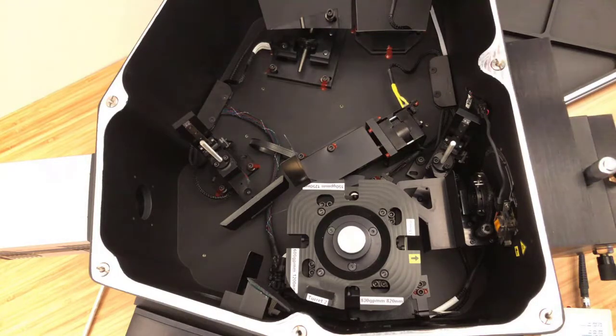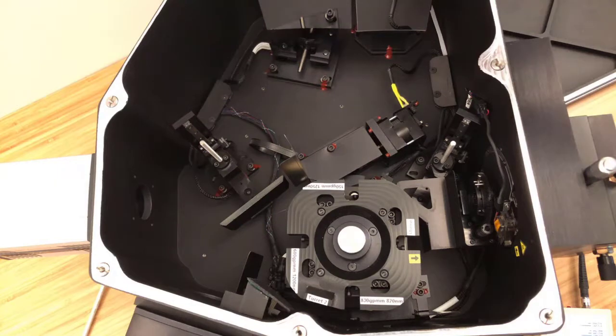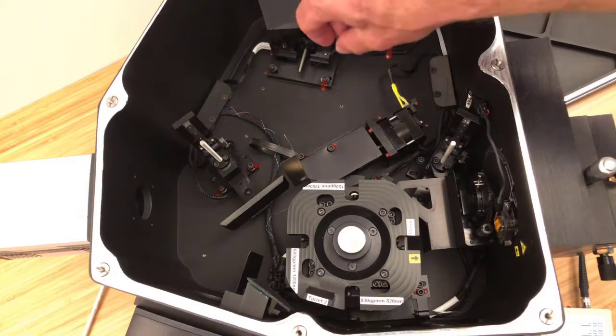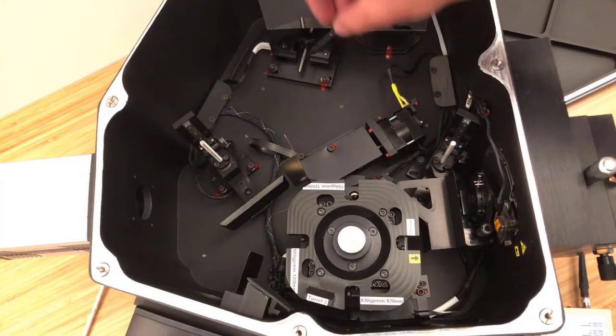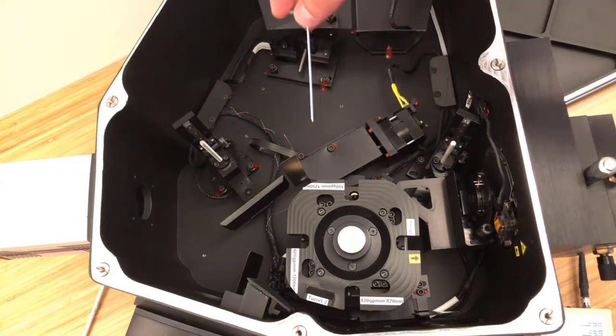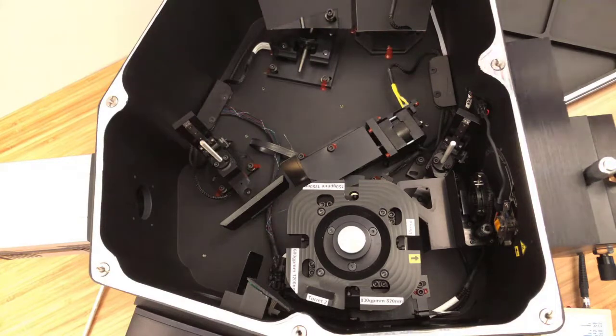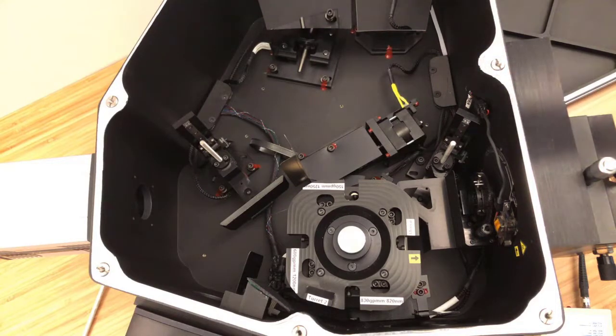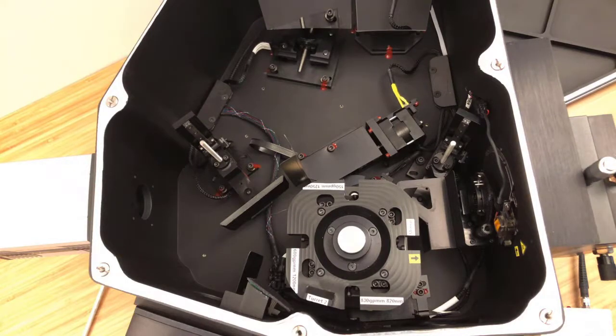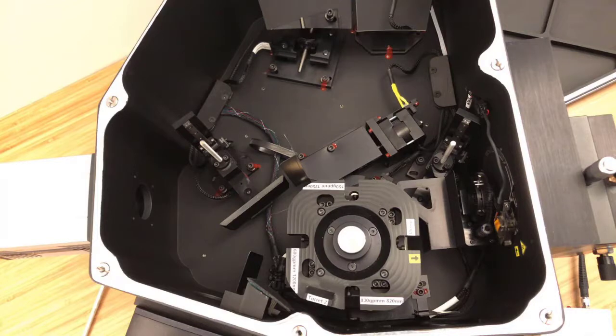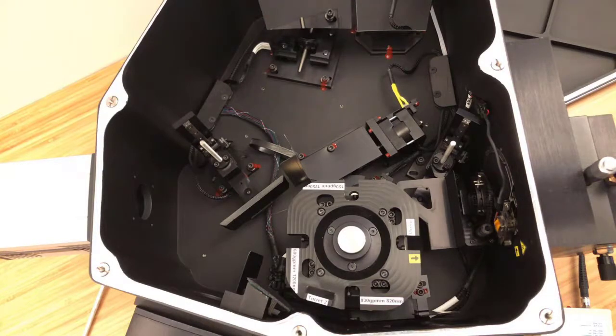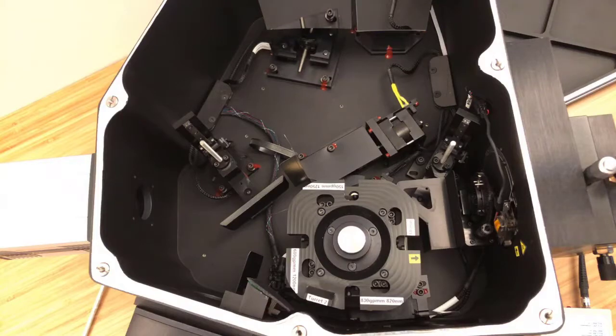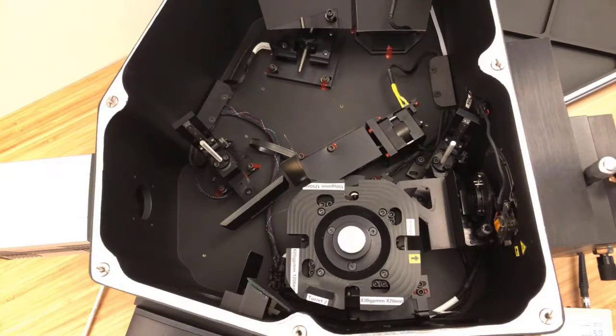I should also mention that this focus mirror is on a precision translation stage here. So this mirror can move in and out and control the actual focal length there. So that allows us to control, via software, an intelligent autofocus feature. Normally, focusing is done manually, say, at the camera, or potentially not at all. And that's unfortunate because it can reduce resolution if the spectrum is out of focus.